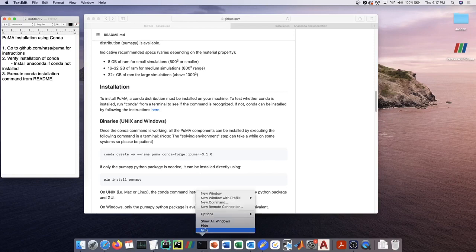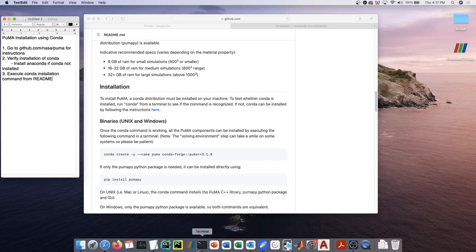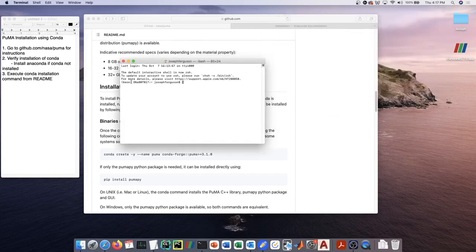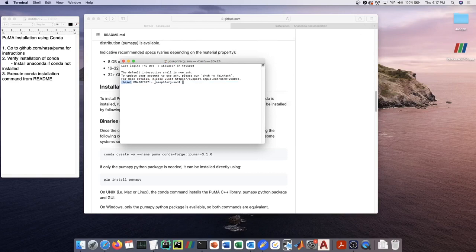The way to know if you have conda installed is to open up a terminal. Once you've opened the terminal, you'll see on the left-hand side next to your username 'base' if you have conda.